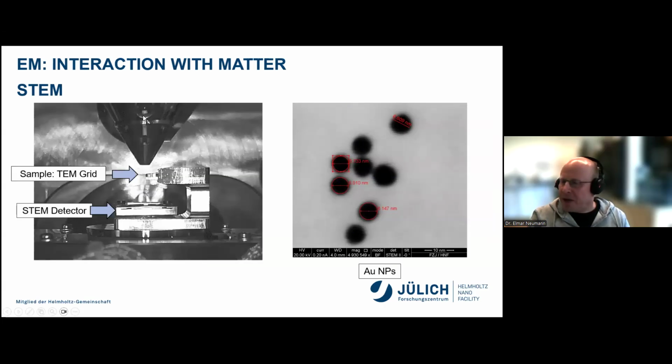Yeah, the last one here in our case is the one with transmitted electrons. A bit like in transmission electron microscopy, it's also possible to measure those electrons, the primary beam that goes directly through and is then deflected from its path by the sample itself. It's a retractable detector. Again, the sample needs to be very thin, or the particles need to be very small in order to observe these. In this case, you get a far better resolution. This is the case where you can get 0.5 nanometer resolution in an SEM as well.